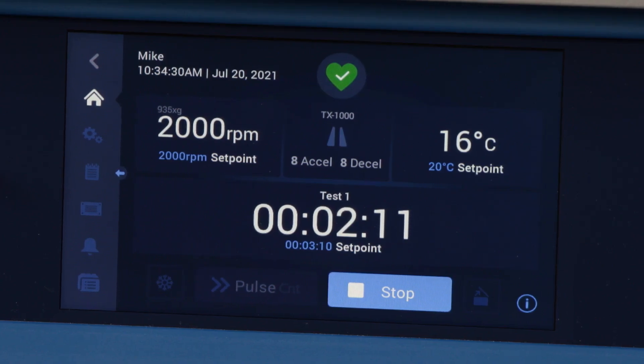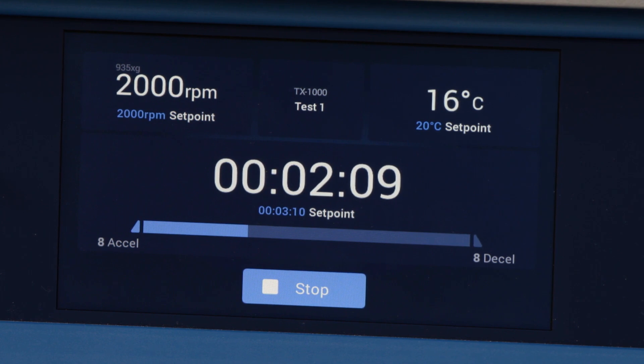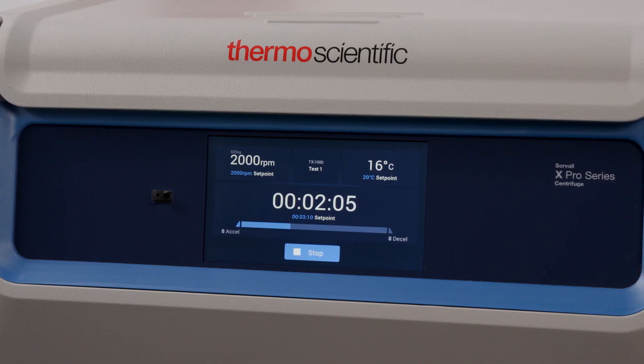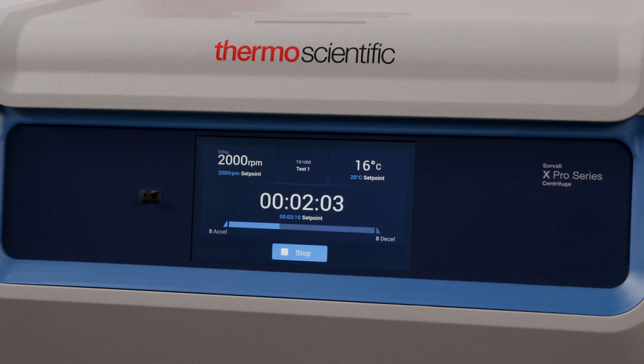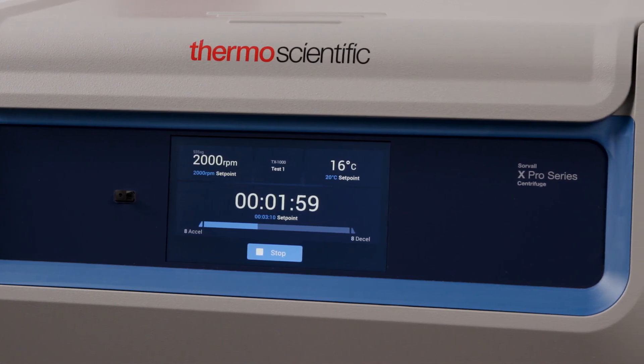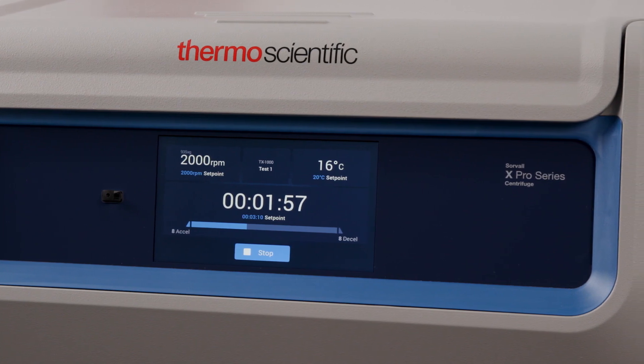When running, the interface goes into Lighthouse mode that will allow you to easily track progress without having to step away from your work. With Lighthouse mode, you can easily monitor your run from across the lab with the enlarged time and tracker bar. Plus, end-of-run alerts can be programmed with customized volume and alarm tone settings.